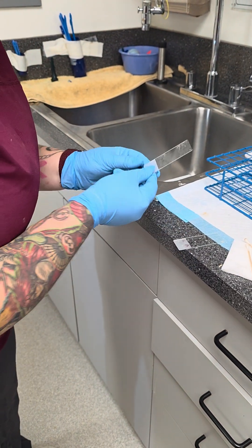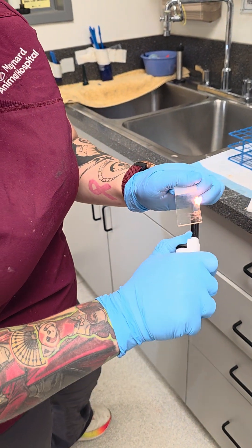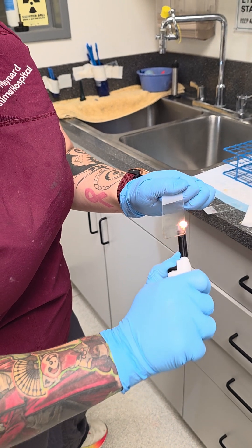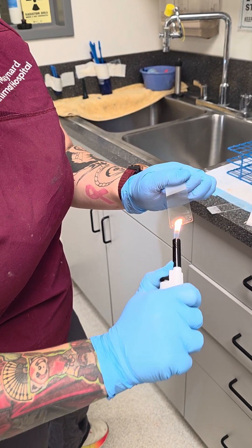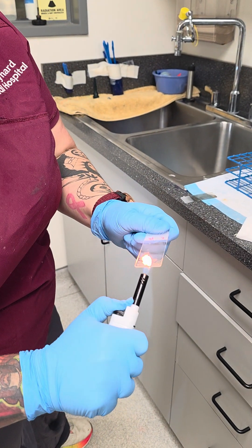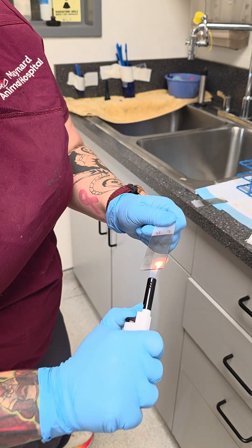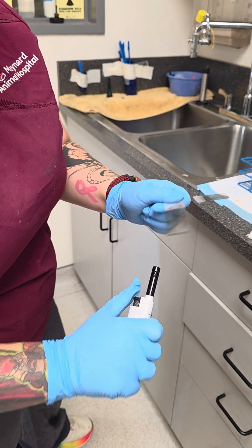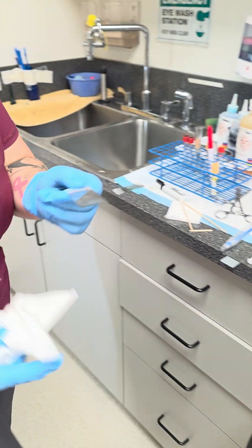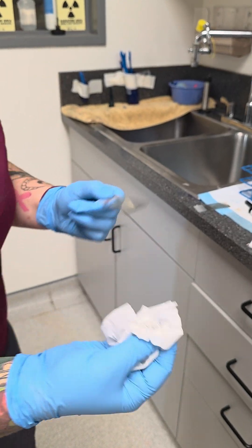Then we're going to heat fix these — take your flame and make sure that everything sticks. Got a little bit of charcoal on the back; that's easy enough to fix with a kind of wipe. Just wipe away the charcoal.